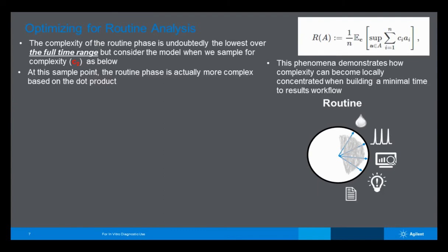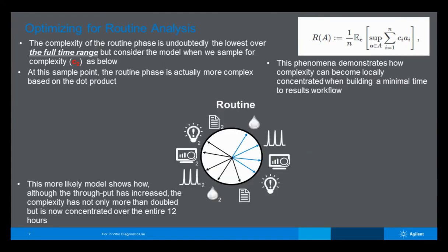And one of the things that's really interesting is when you consolidate all of your complexity down to a very, very brief period of time, you can actually have an overall less complex model, even though you have more transitions. So you could actually have more transitions, but if you consolidate them into a certain area, if you localize them, it actually statistically is less complex there too. So it's kind of an interesting observation that you get from the statistical models that wouldn't intuitively come out. However, the problem is that it's not very likely.